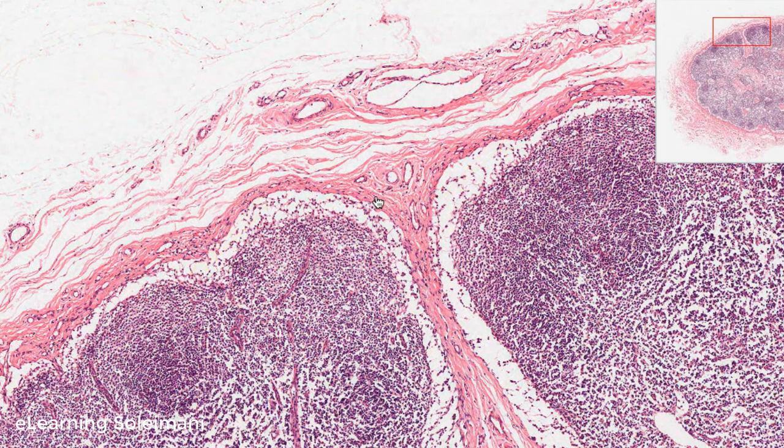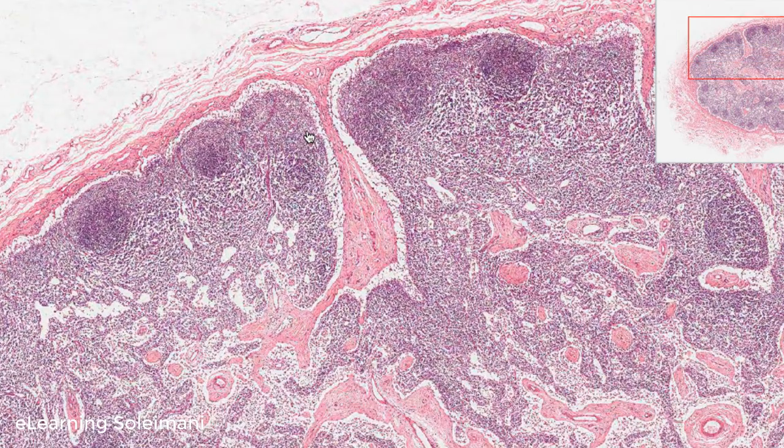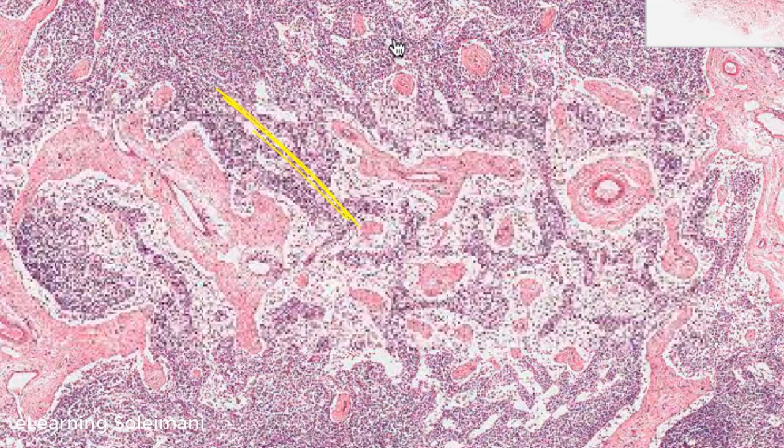The function of the lymph node is to purify the lymph. The lymph enters the subcapsular sinus through the lymphatic vessels from the convex part of the lymph node. Under the sinus, the lymph node is divided into two regions. One, the cortex containing lymph follicles. Two, the medulla, which contains cords of lymphocytes and other cells of the immune system.